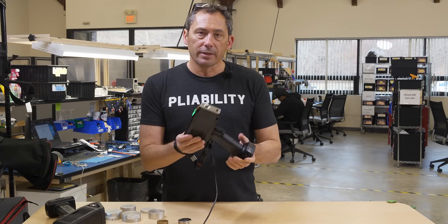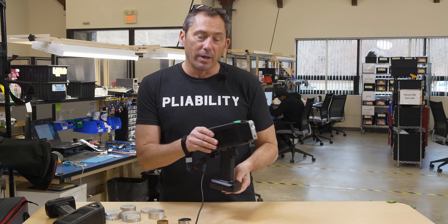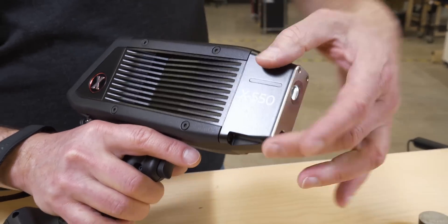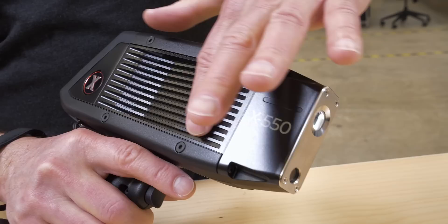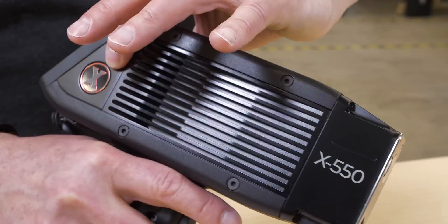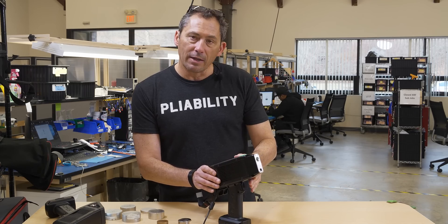This analyzer is the X-550. There's a sister model called the X-505, designed with an all-metal frame from the nose all the way back. It's got these nice heat-sinking fins so you can use it shot after shot continuously all day no matter how hot the climate.